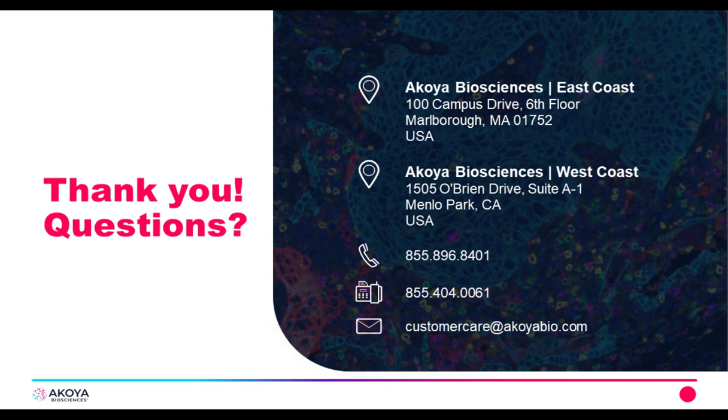Thank you. Dr. Carlson, let's stick with you real quick. Can CODEX data be analyzed by third-party pipelines or software packages? Absolutely. Excellent. Okay, Dr. Saunders, let's jump over to you.